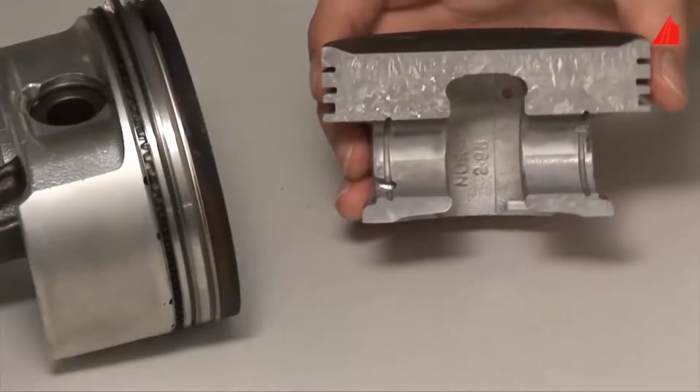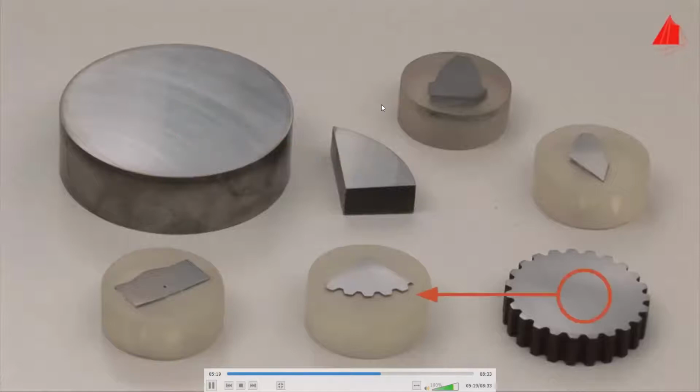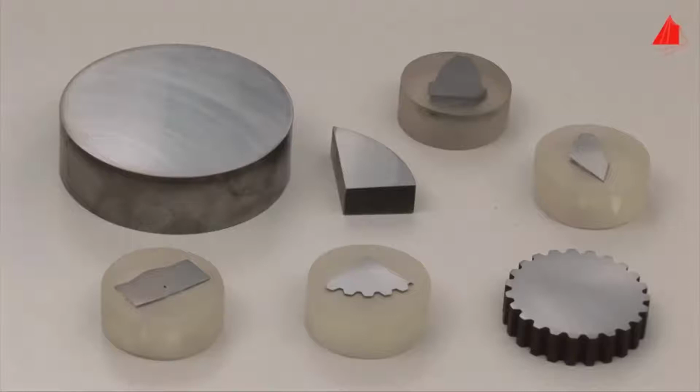Virtually all materials of our world can be examined metallographically. To show part of that variety, we will look at some additional test pieces made from different steels. All of these samples have been sectioned first. Some of them are so small that they have been mounted in resin for easier handling. And all of the samples have been wet ground with medium-grade abrasive paper.